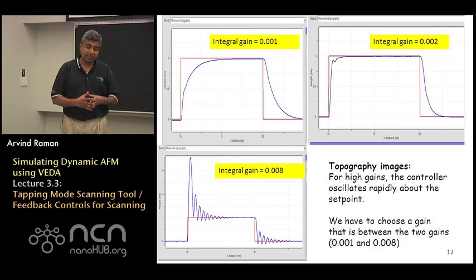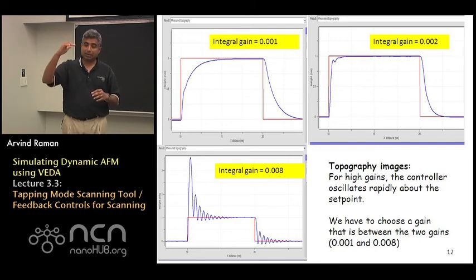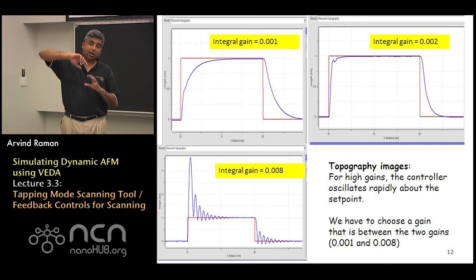This was discussed in the contact mode imaging as well. What is happening is that basically the Z controller is overreacting to the changed error signal. So when it first approaches the step the amplitude decreases.